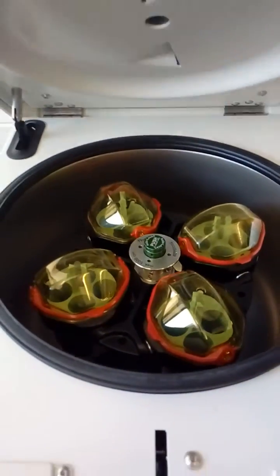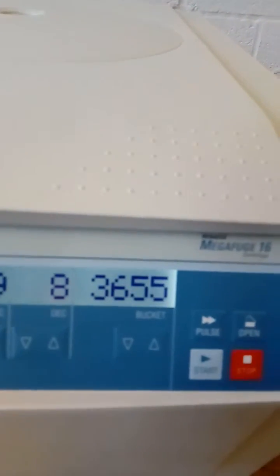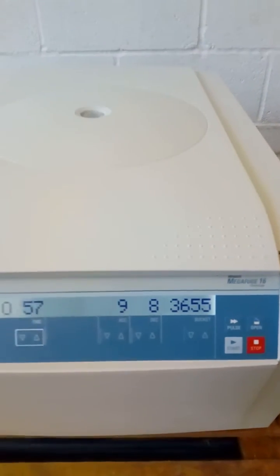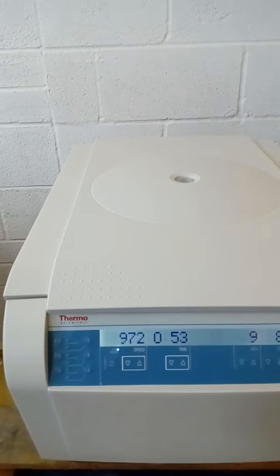Just closing the lid now. I'll start the centrifuge and give it a small run for demonstration purposes.